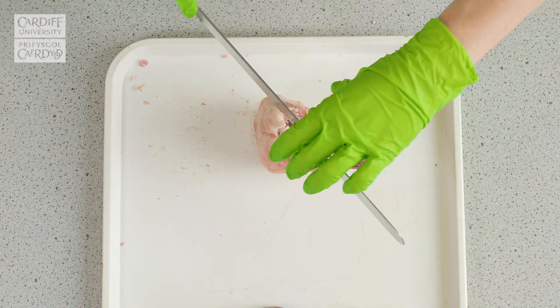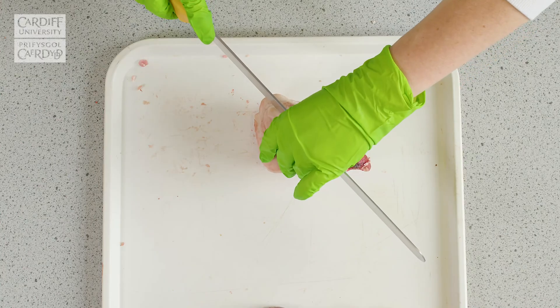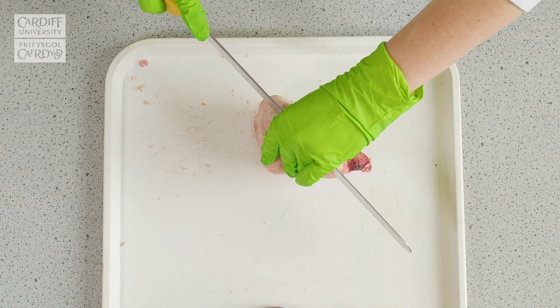And as mentioned, in one single slice, try to cut through into the kidney.